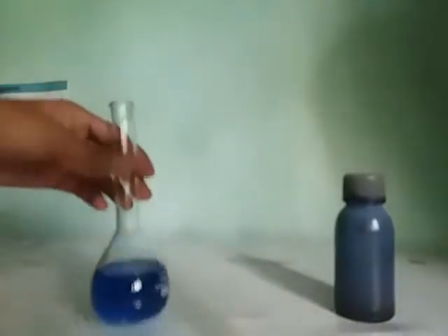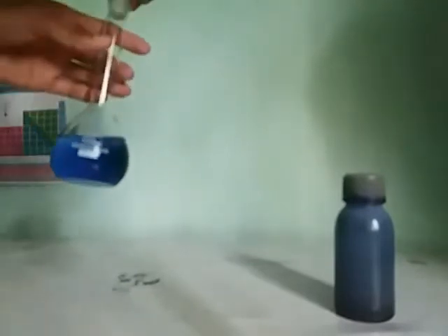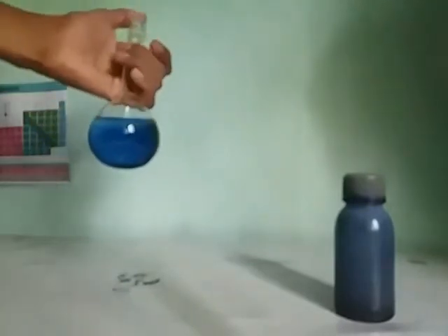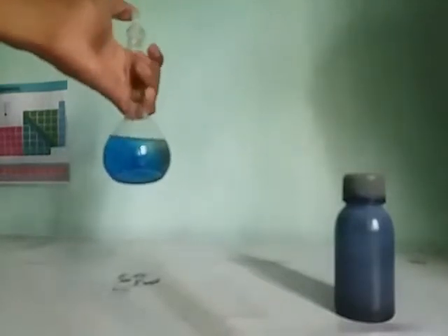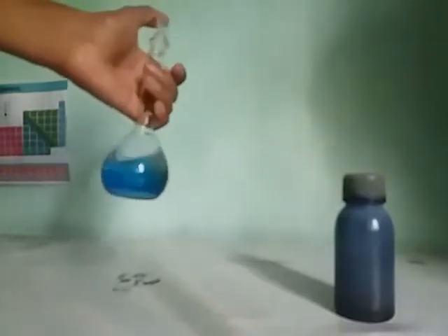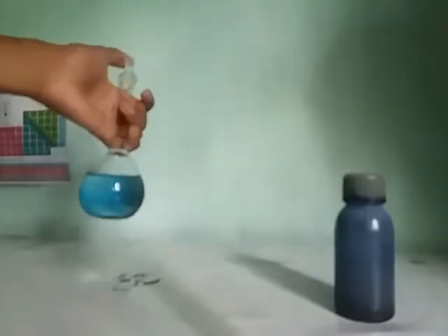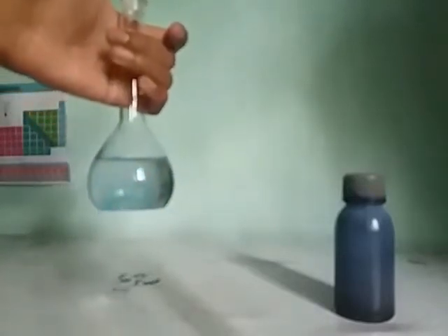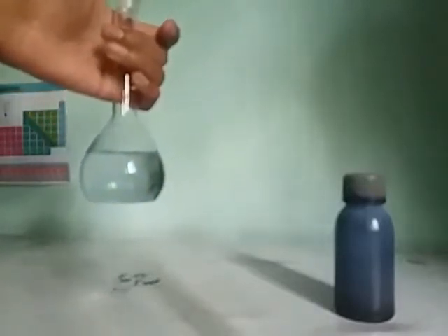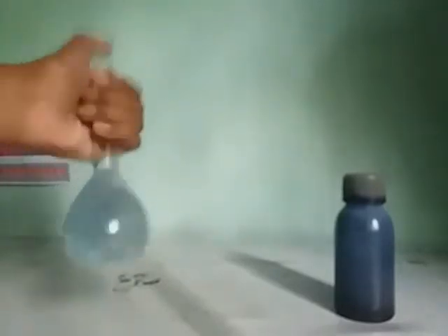You can see the solution is changing — now the solution turns colorless. And now shake it.